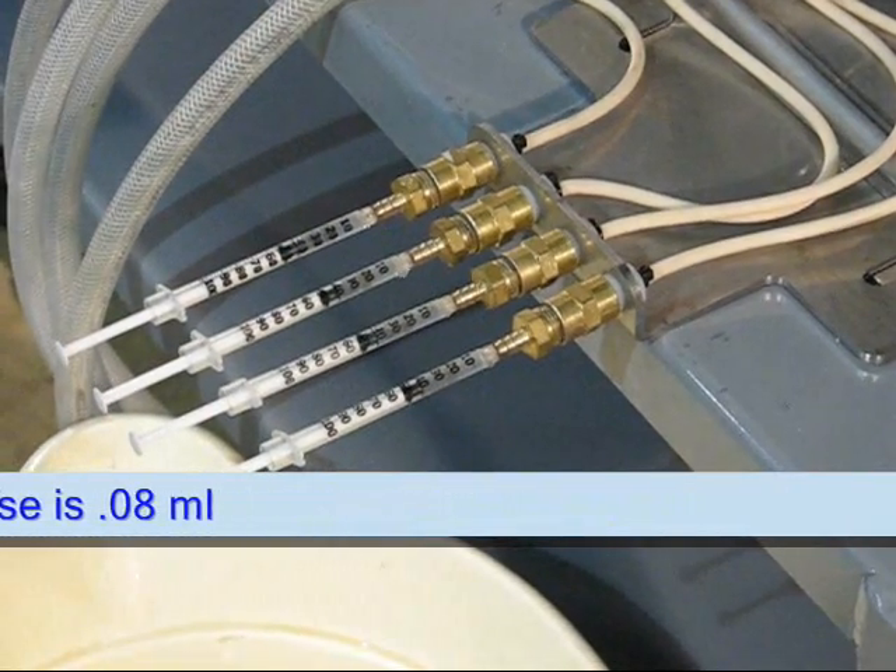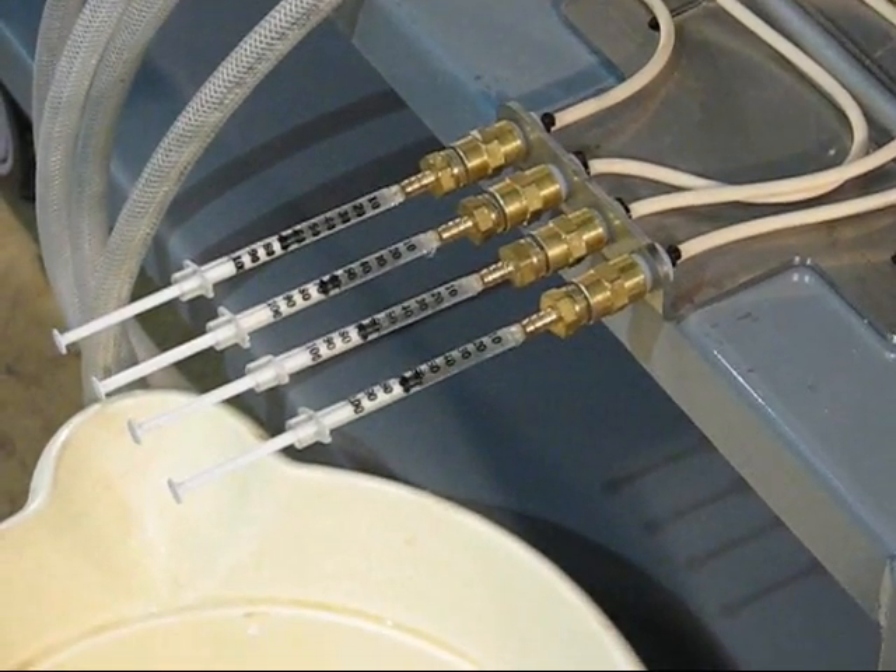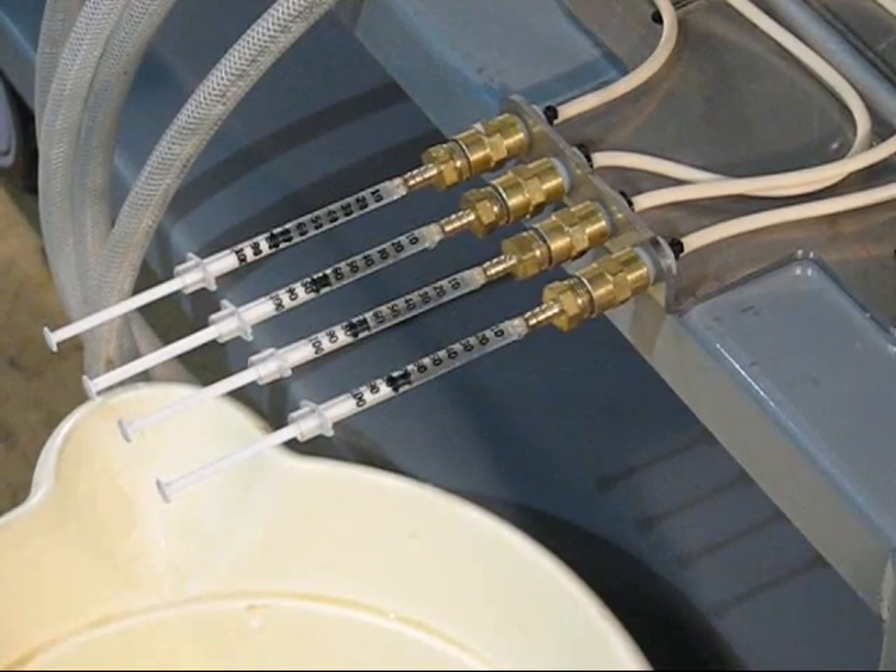Here you can see the highly repeatable flow as we accumulate the doses in four separate syringes.